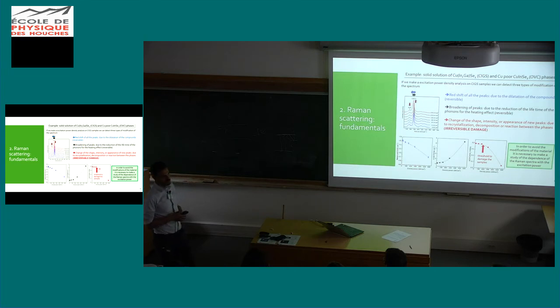And is it a spot laser or a beam? Normally what we use here is a spot that is moving, or the sample is moving. The spot is around 1-2 microns, but you don't focus it on a single point.